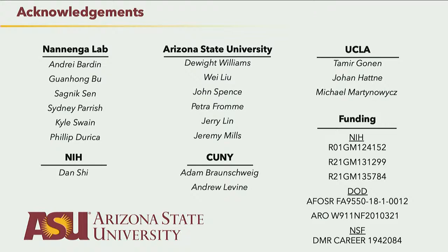Thank you for this very nice talk. I have a question. You have some examples of small molecule diffraction that achieve a resolution of 0.6 angstrom. I wonder how often you achieve this resolution.